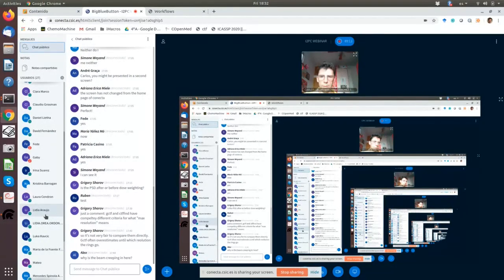But you want to take off those particles which have something too close together. You have seen this extreme case where I only use these particles, and they drive the alignment, and the 3D reconstruction tries to satisfy those nearby particles too. So ideally, in single particle analysis, single means isolated. The theory goes for isolated particles, but sometimes you don't have them. But then at least you have to be aware that you have a mixture in your 3D reconstruction.